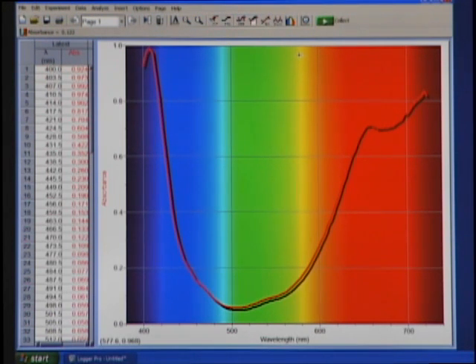So one of the beauties of doing this experiment with the SpectroViz is that instead of telling the student which wavelength to use, the student can discover that for themselves. So here we have a cuvette that has a solution that has a green color. That means it's transmitting green light, and it means it's absorbing very poorly. And if you look at that part of the spectrum, it's a nice teachable moment, we can see that the absorbance in the green part of the spectrum is very low.